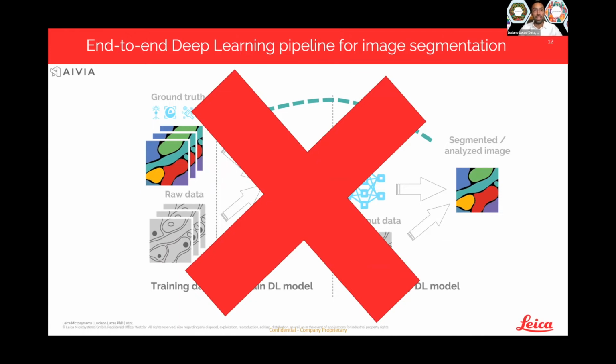Another thing that got me thinking was that we already have software. There's image analysis software that has been out there for a long time. I think ImageJ, or Fiji, is like 20-something years old. And this software is used by millions of people. I'm thinking about the whole period of time, all the users. It's probably quite a lot of use sessions.